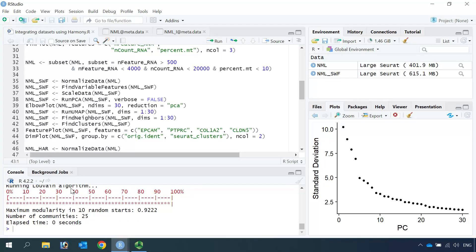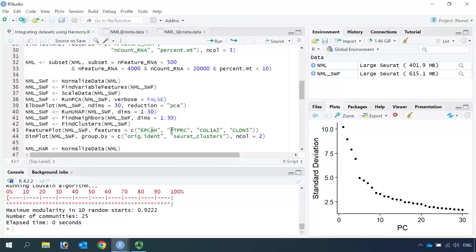We have 25 clusters in the merged dataset. We can use the feature plot function to identify cell types using four markers: epithelial cells, immune cells, mesenchymal cells, and endothelial cells in the lung. Let's run the feature plot function to identify these cell types.